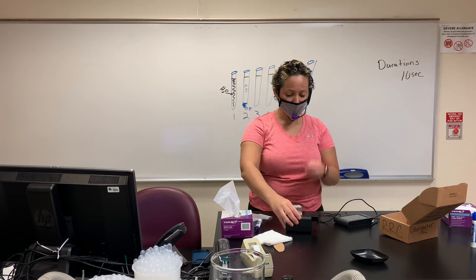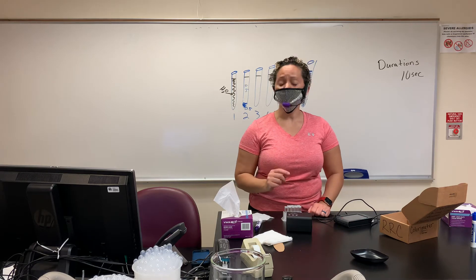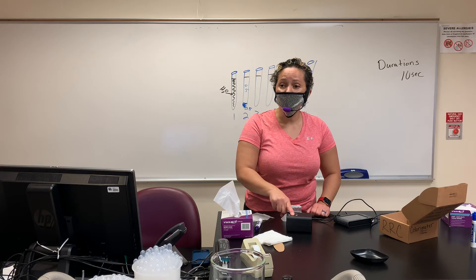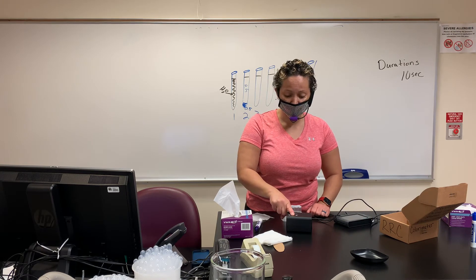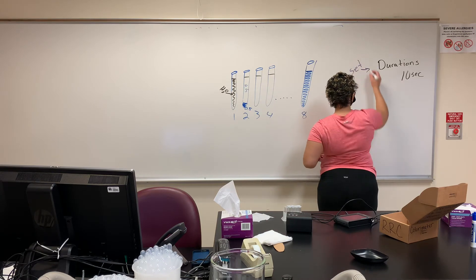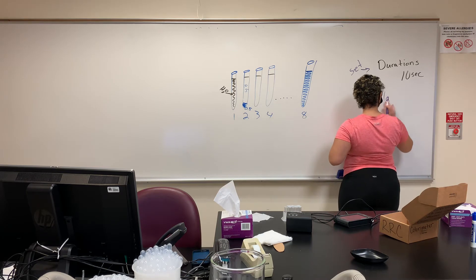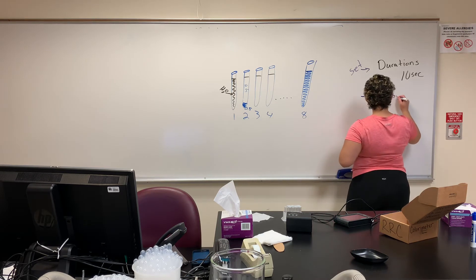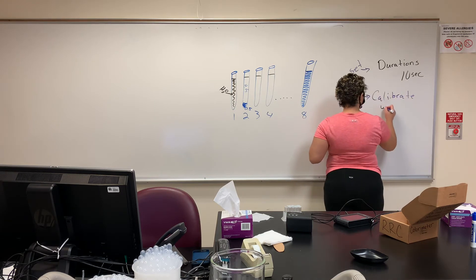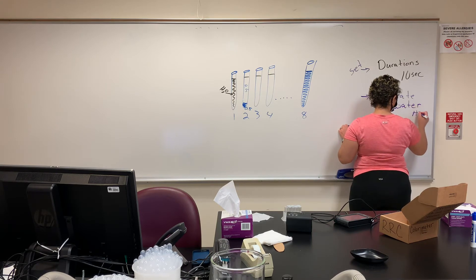Then you are going to put it in the colorimeter with the smooth sides facing side to side, because that's where the light goes. Put it in there, place it down, close it up. We have to calibrate it — hold the calibration button until the red stops flashing. Set duration, and then calibrate with water, which is number one.